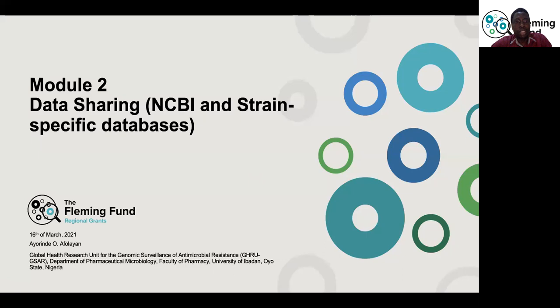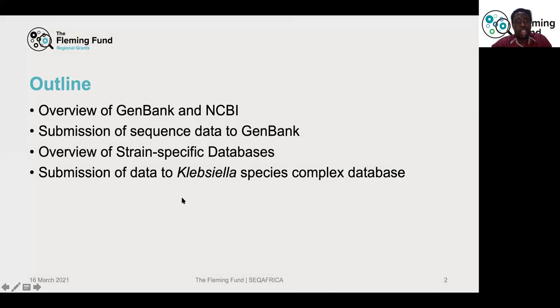I'm going to be giving a presentation on data sharing, NCBI, and strain-specific databases. I'll be guided by this outline: overview of GenBank in NCBI, submission of sequence data to GenBank, overview of strain-specific databases, and submission of data to Klebsiella species complex database.